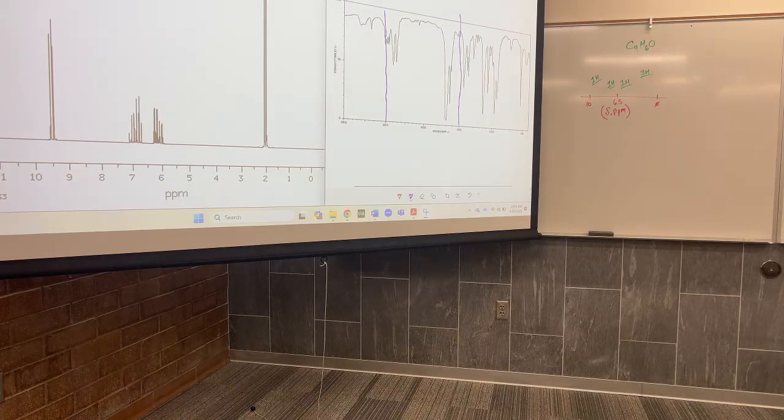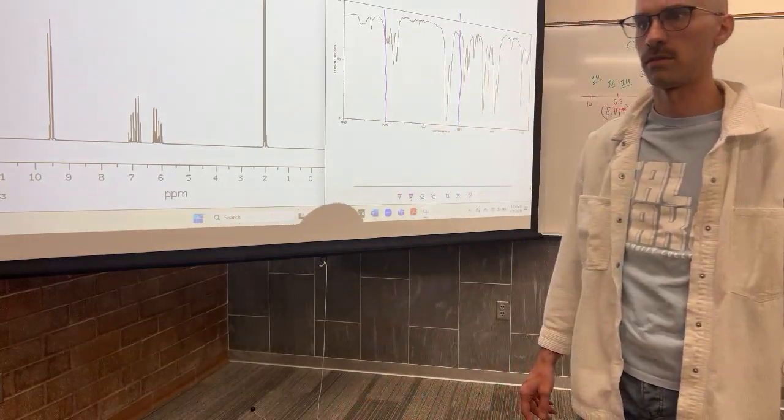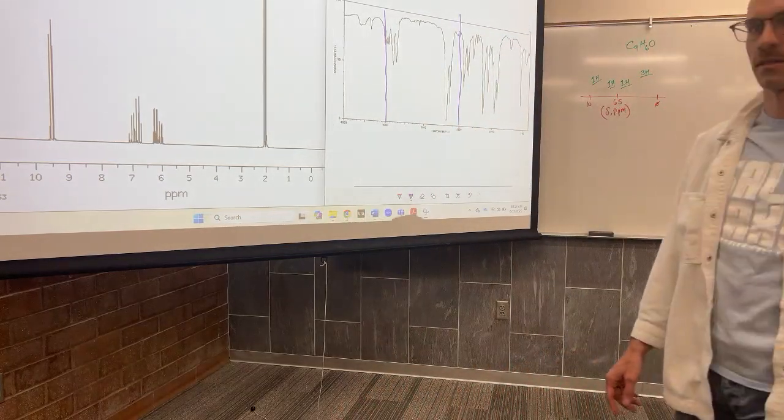Well, the range here is from 9 or 10 to like 12. So if it's in that range, good. Okay, so use that as evidence then. Oh, that's not C. Nope. Use your NMR correlation table to help you assign that signal. Look at that range. That can push up. There you go, Cameron. You're onto something there.